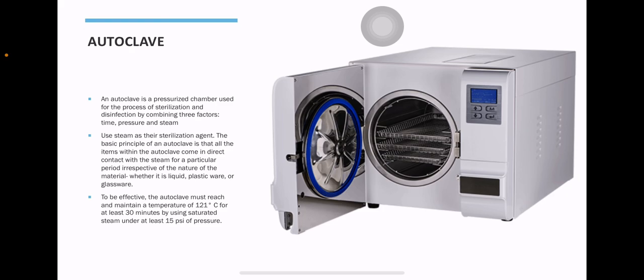But if for sterilization, it is 15 minutes. So everything must be exposed to saturated steam to be properly sterilized, and this includes media, glassware, instruments, and even biohazard waste. And please don't forget also the biological indicator of your autoclave. It's your Geobacillus or Bacillus stearothermophilus.